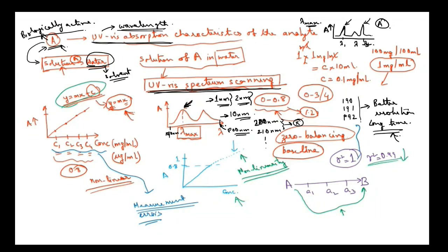So first, once we do the spectrum scanning, fix or identify the wavelengths at which we can do the single wavelength measurement.